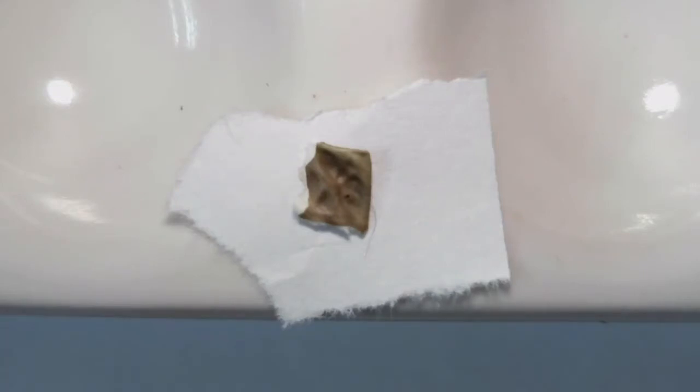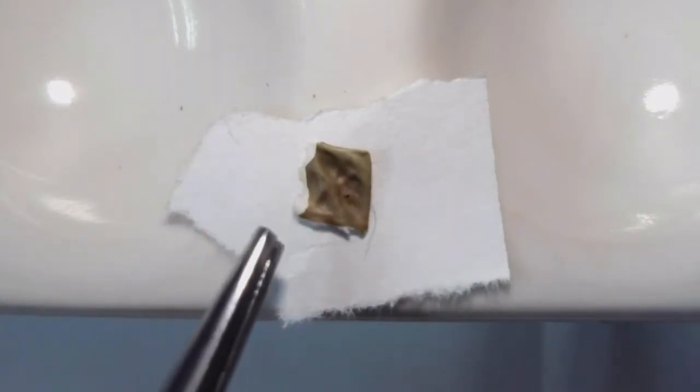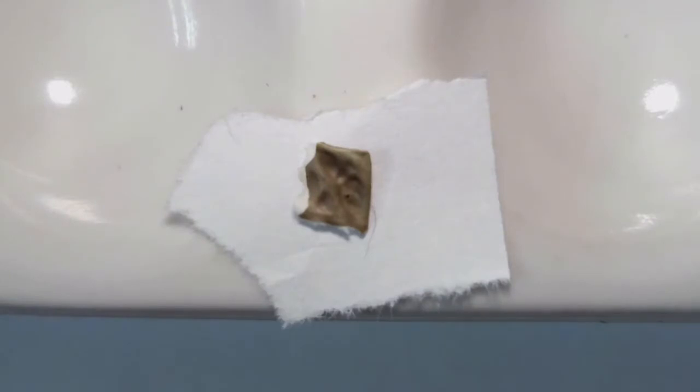Okay, so now we're going to go over some examples of the K-test. And so here I have prepared already a small piece of Lobaria pulmonaria, and I made sure to expose the medulla, that's that white edge along there next to the cortex, because this lichen has stictic acid, and with stictic acid you would expect the medulla to react with the K reagent and turn yellow.